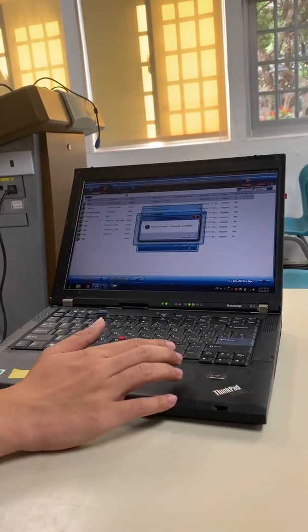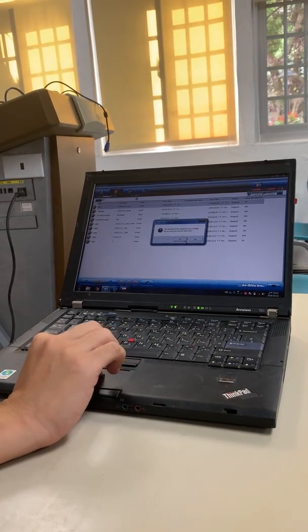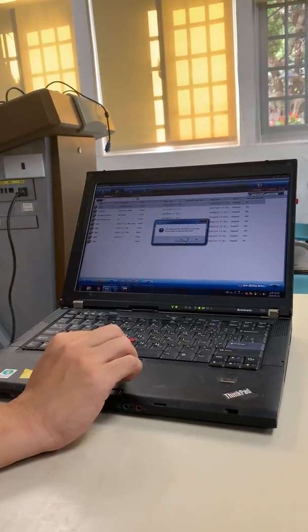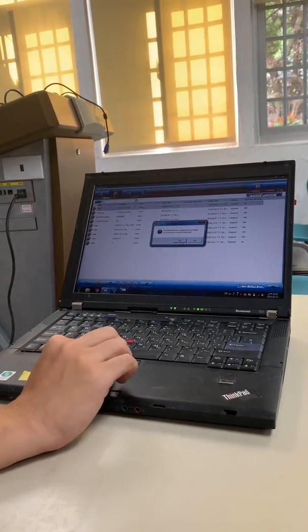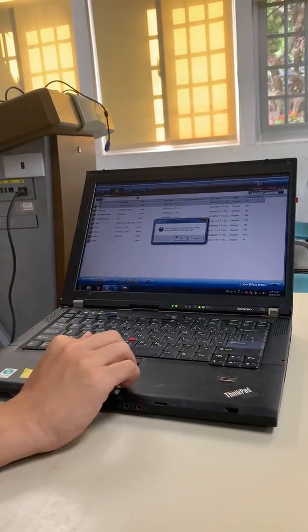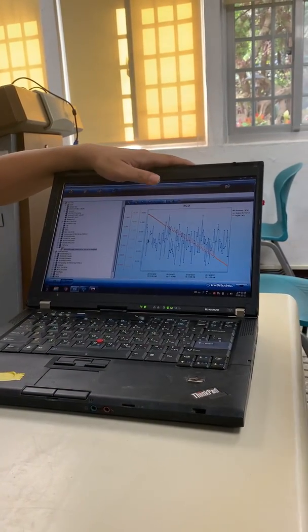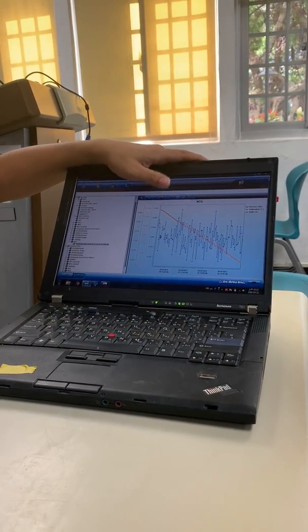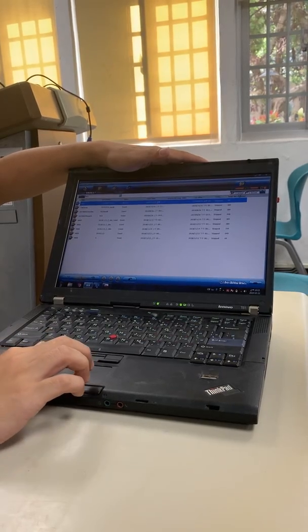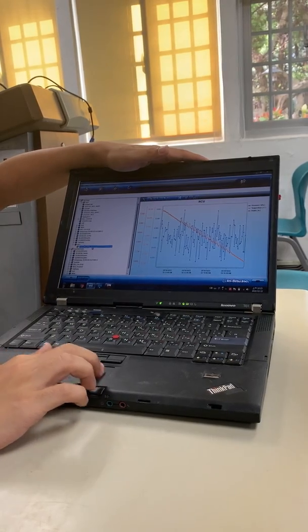If you recorded for several hours, downloading may take more than 10 minutes — sometimes only 9 seconds for short recordings. While it downloads you can do other work. Once downloaded, you can view the data in the software by clicking here to see your downloaded data.